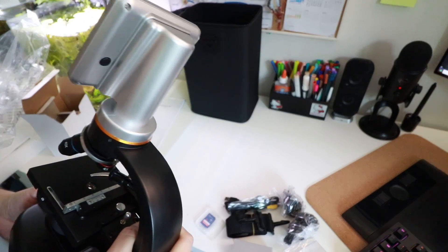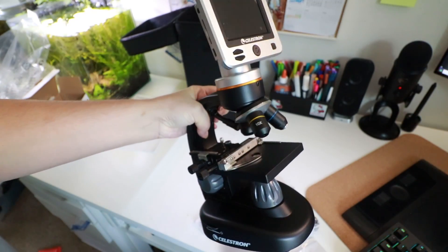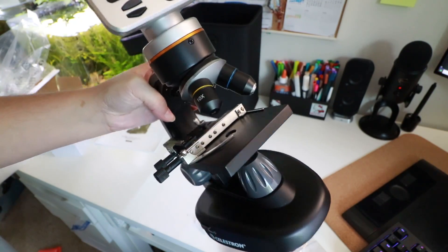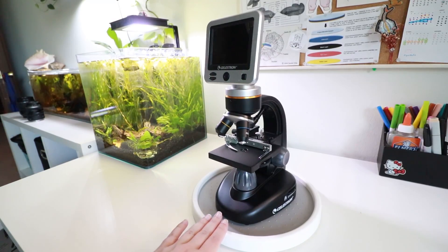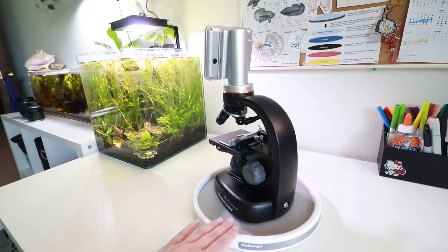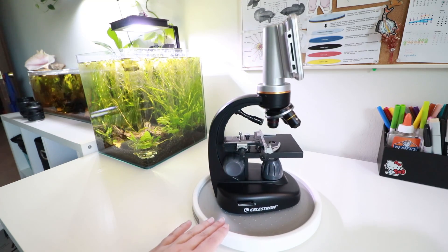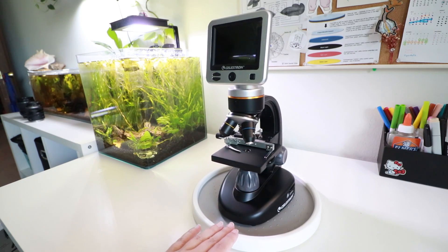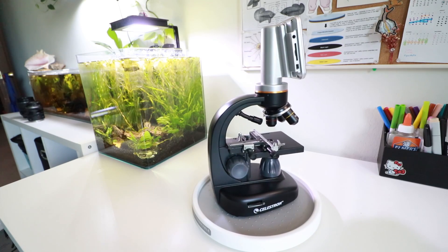Overall, the microscope is pretty heavy and solidly built — it feels pretty legit. I'm not an expert on microscopes, but so far, so good. I'm very excited. So this is what the microscope looks like from all different angles — it's pretty cool. I haven't turned it on yet, but I definitely want to try out the sample slides they provide so I can practice using it and get a feel for it. And there it goes — it's spinning!